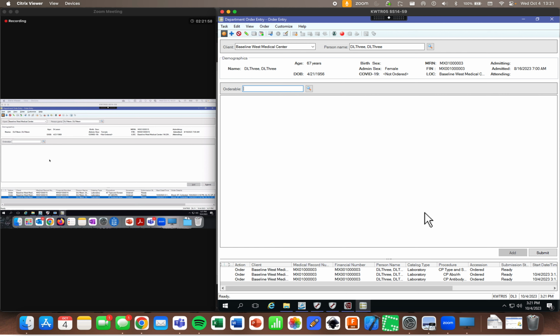If it's not marked as required in the order entry format, then hypothetically you could, let's say I need to go back in and adjust one of these orders. You can just double click on it and it'll pull it back up, assuming that you haven't submitted it yet. Once you've submitted it, then you'll have to actually go in and modify or correct the order. But if it's a required field, then you won't even really be able to get past that point.